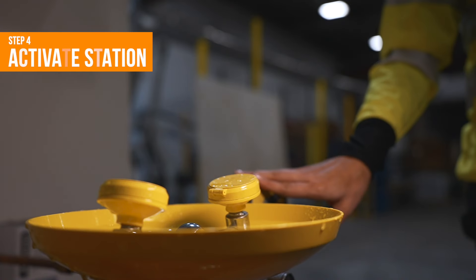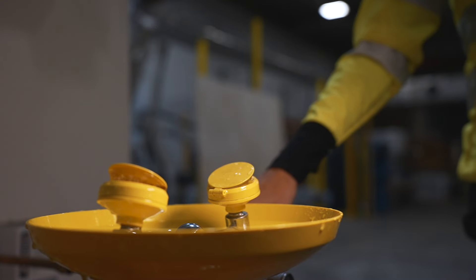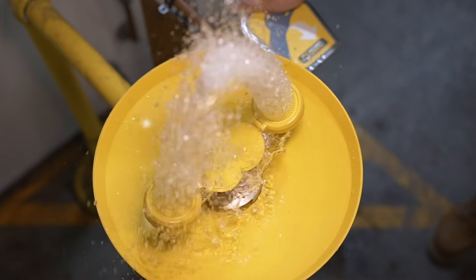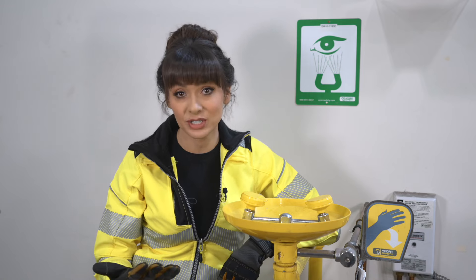Step 4: Activate the eyewash station to clear out stagnant water and make sure it's running right. Step 5: When you activate the eyewash station, watch to make sure both nozzle caps come off with the pressure of the water flow without you having to move them yourself. That way you're not stuck dealing with stubborn caps in an emergency.